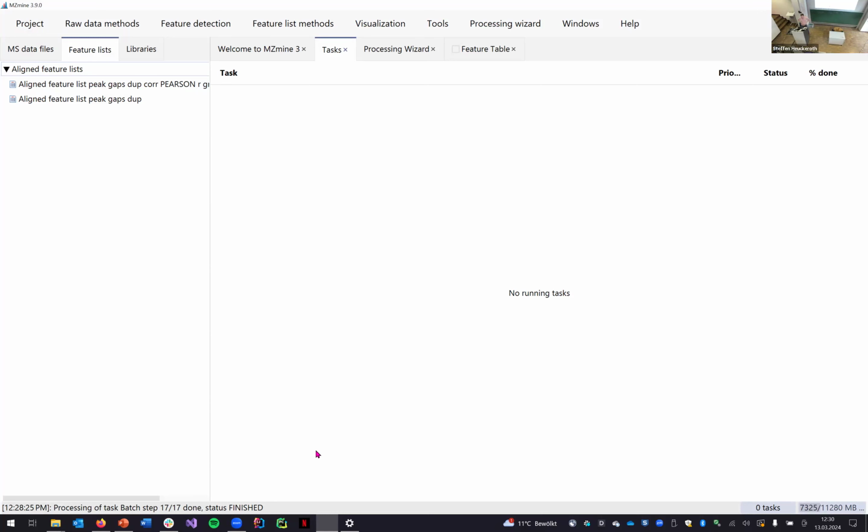Parameter optimization based on your data set, right? So you choose 3, 4, 5 data files out of hundreds and you feed the software or the source code with these files. And then choose ranges for the parameters. And it gives you what is supposed to be an optimal number for every parameter that you have, right? Yeah. So it's a starting point. It's not ideal, but it's a starting point.